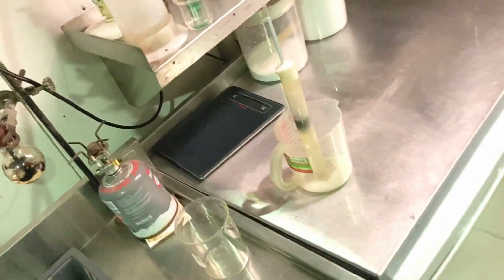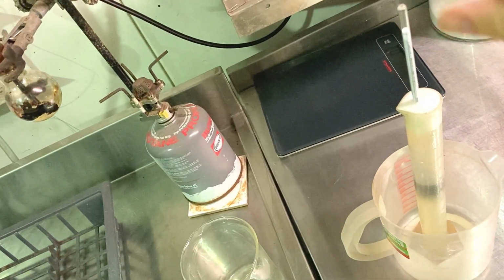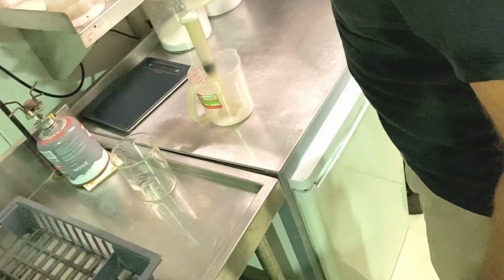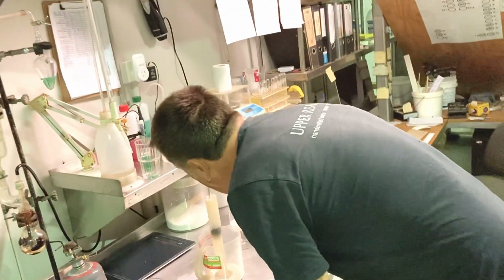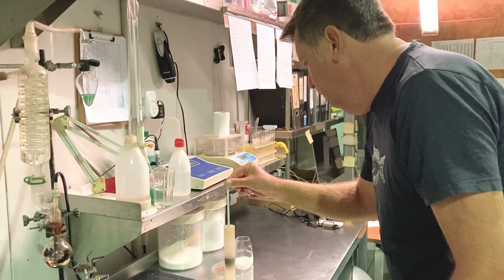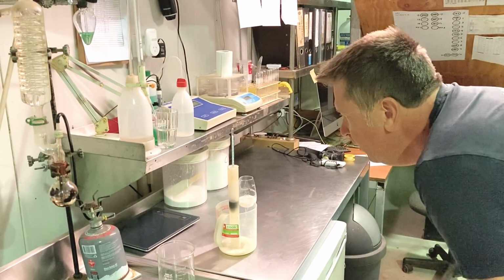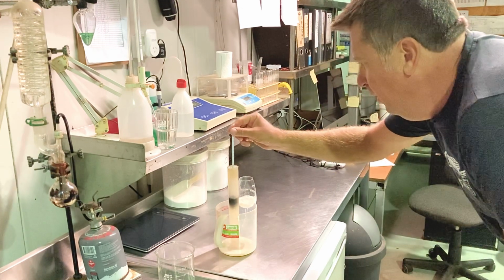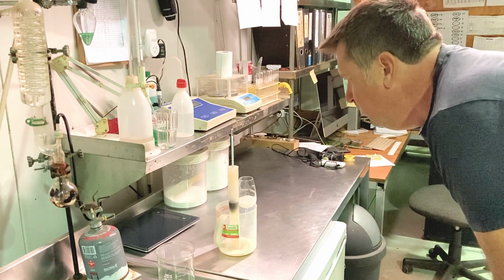So if we go up, we can see it. It's pretty full. He's cleaned everything down, obviously, twice. So we give it a bit of a spin, and we can just make sure that there's no bubbles adhering to it. So now he's just topping it up, so it's super full. And then he bends down to read it, because you've got to obviously bounce it a bit about, like he's doing, so that there's no air bubbles adhering to it, so you get a true read. And then you read it from the top, so he can see where the meniscus is, and he's taking a reading off the hydrometer. It's got a scale on it, which will show you.